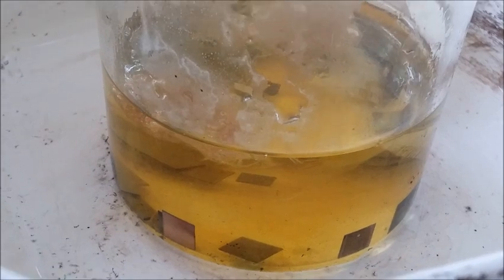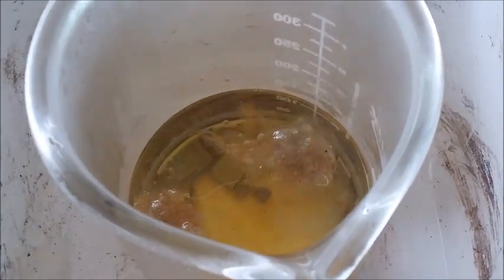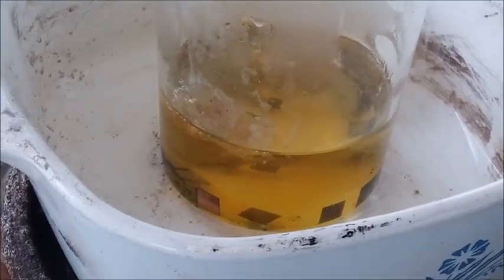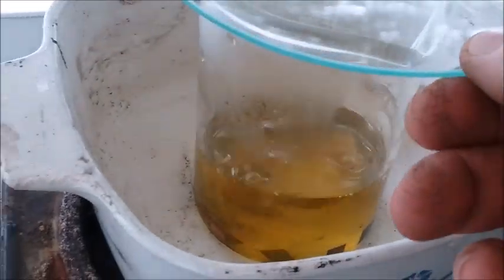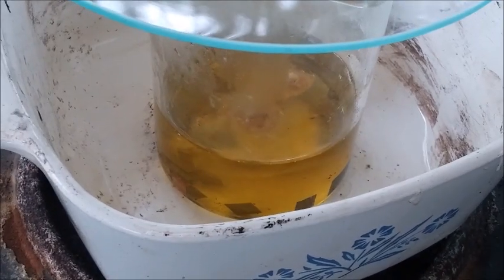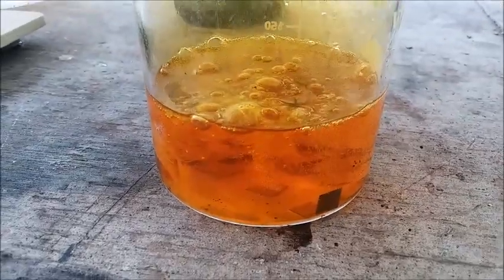All right, the aqua regia hasn't really even had a chance to warm up yet, and already got a pretty good reaction going on in there. The gold's so full of bubbles it's floating. Nitrogen dioxide bubbles. So yeah, we got a really decent reaction going on. And yeah, it's just barely above room temperature already. So, aqua regia working good. See how vigorous the reaction is.